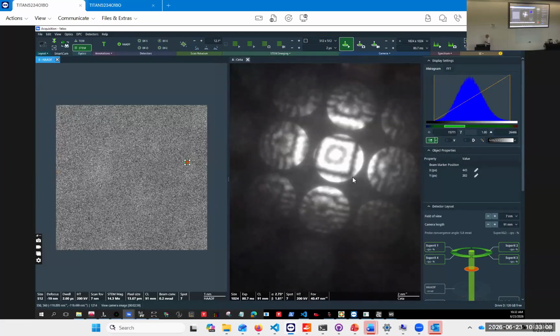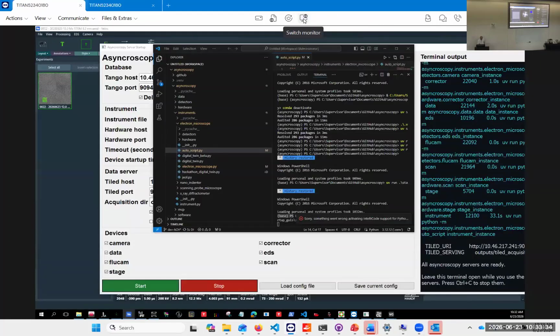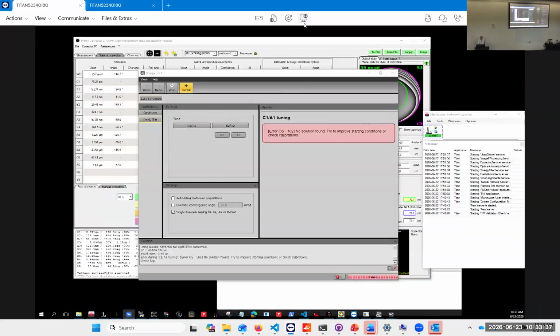So 10 milliradians, a hundredth of a radian, would be about 1 degree, right? And so we want to move it only a very small fraction of that. So we can try that. Since it's a summer school, we try things out. Let's see whether we can do that.